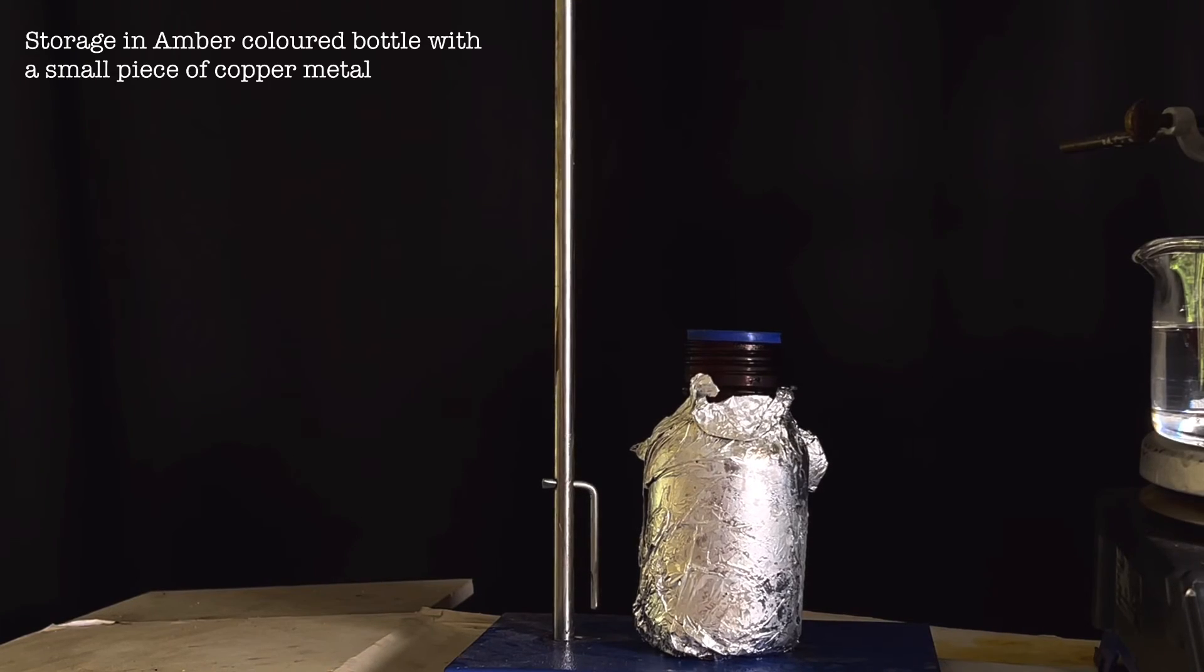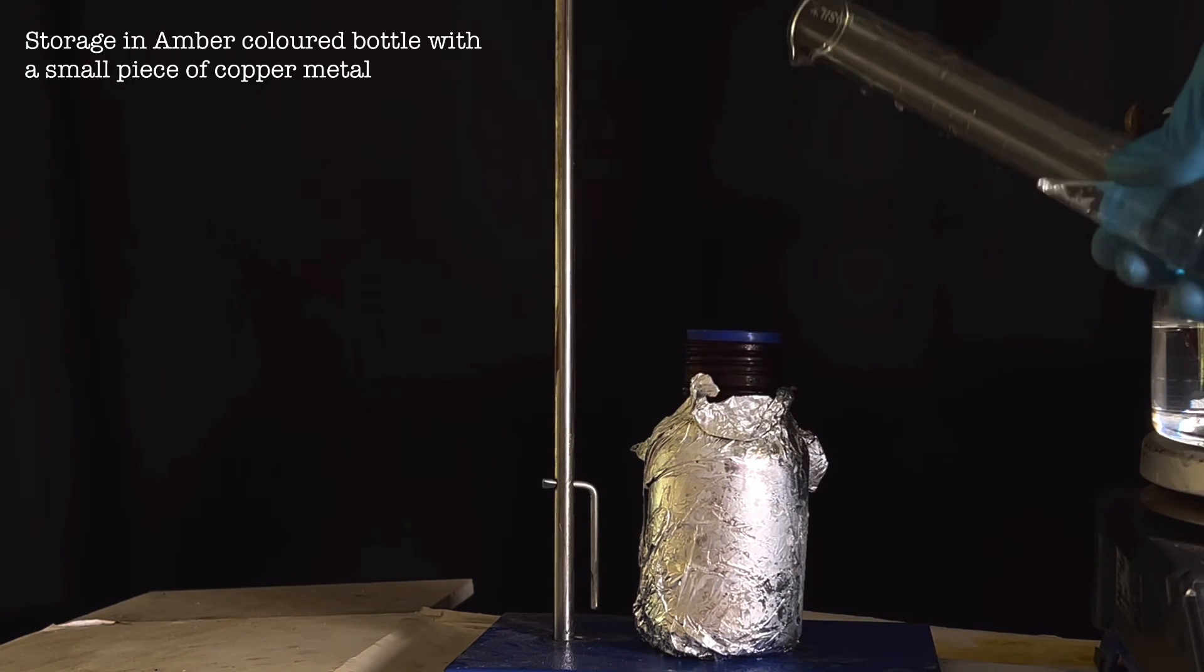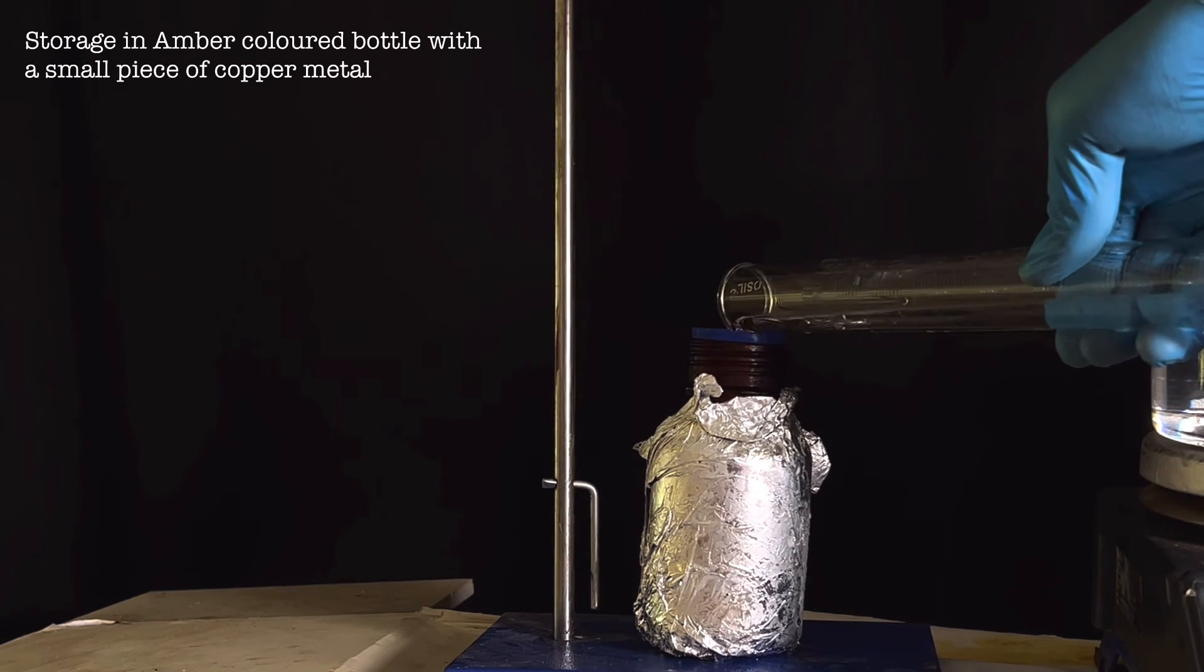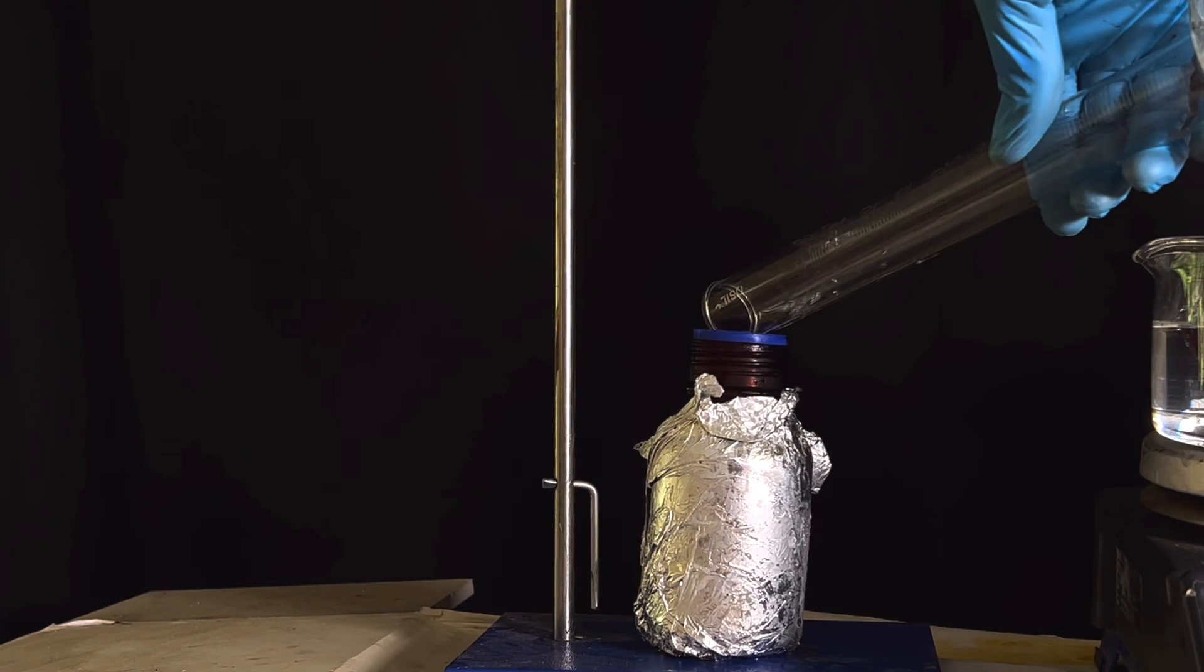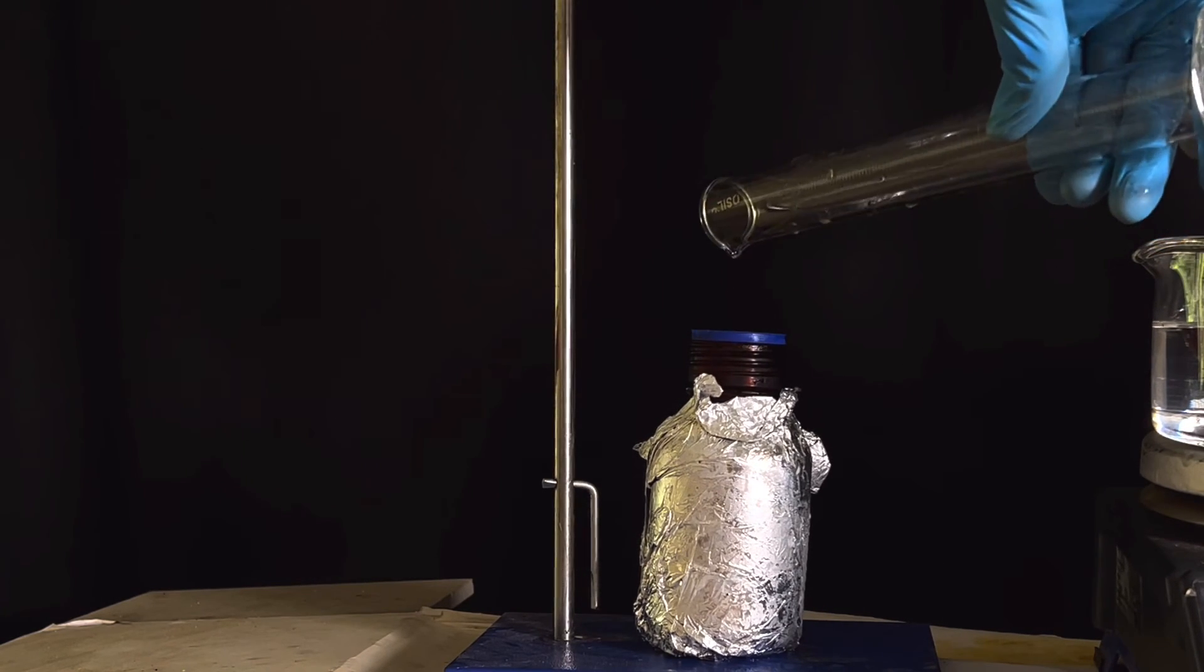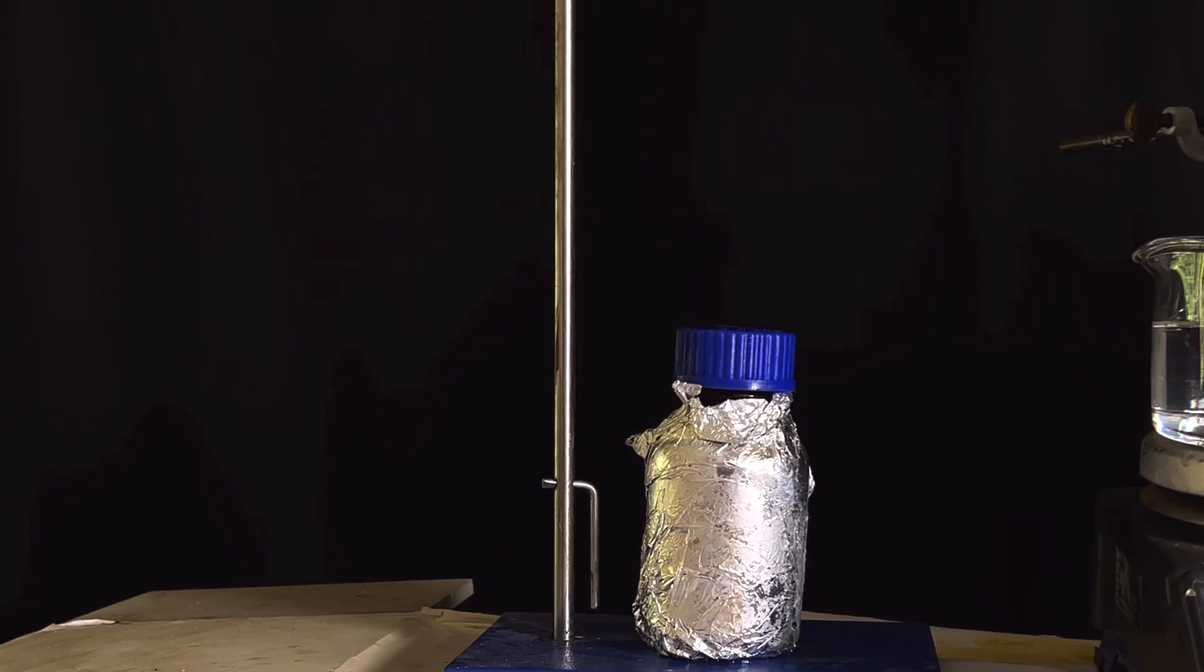It was then poured into an amber glass bottle for storage. The bottle contains a piece of copper metal to prevent decomposition and the bottle was covered with aluminum foil to provide extra protection from light.